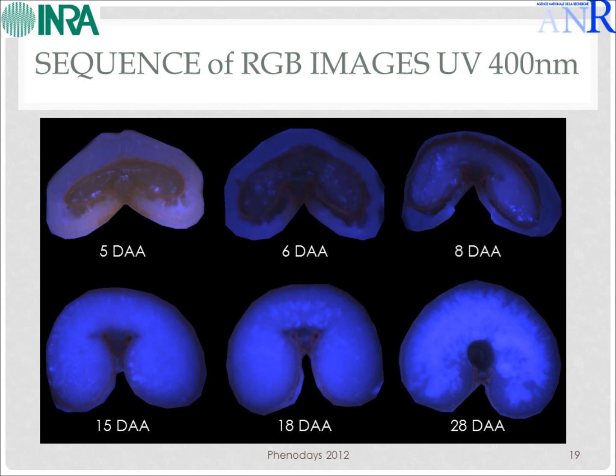And I don't know if you see, but there is a red fluorescence here, and around the endosperm. This image, like those previous, are classified with the days after anthesis.